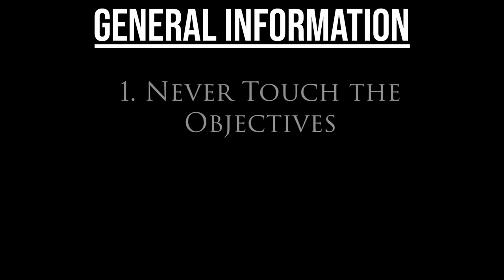Let's talk through some general things to keep in mind when working with microscopes. First, never touch the objectives. If you need to work with a different objective, you should use the top of the revolving nosepiece to affect the change. Handling objectives directly can loosen them from the nosepiece over time.